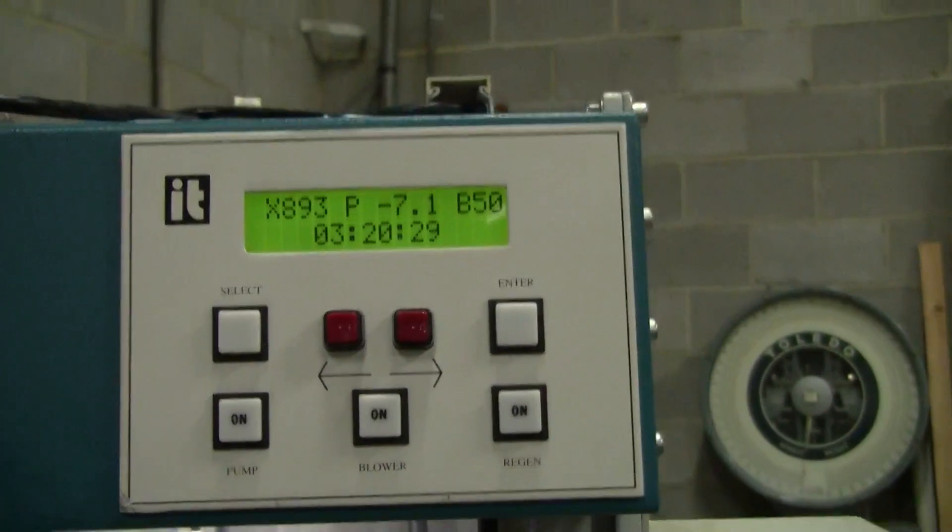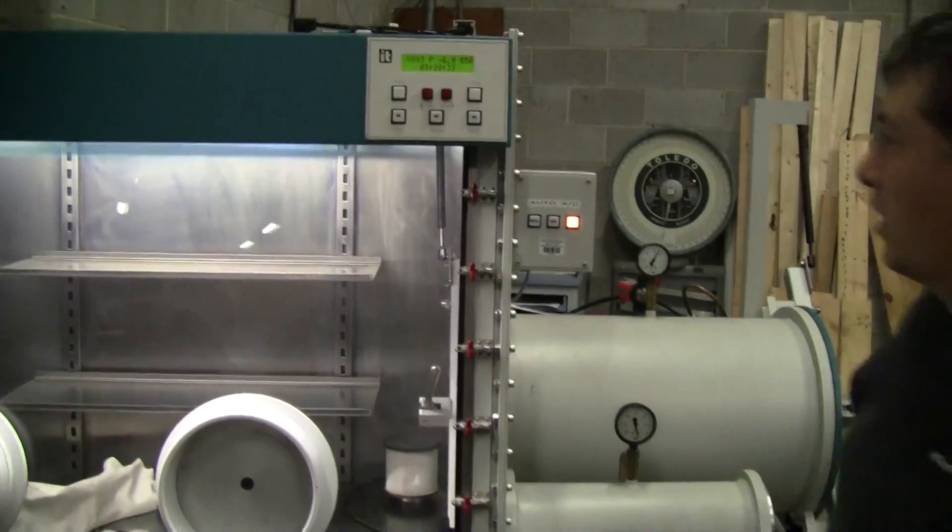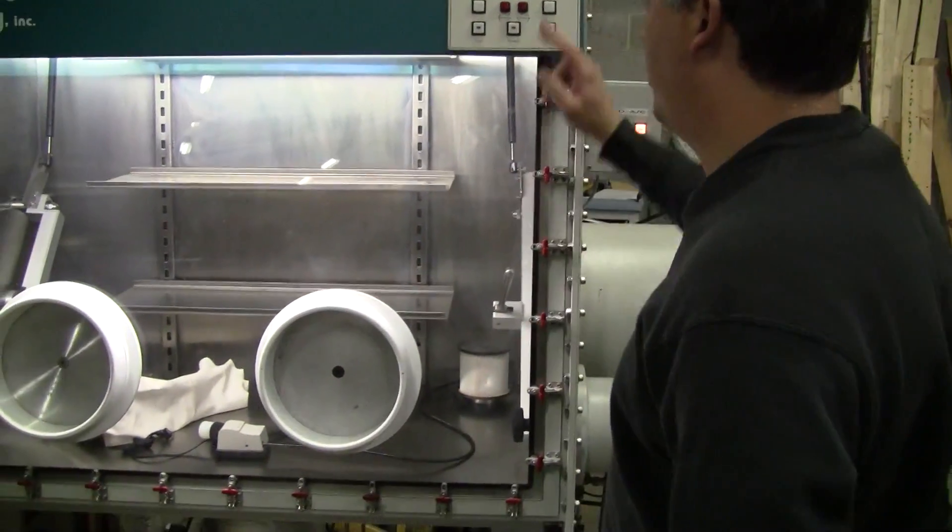Once the air line is plumbed in and hooked up, that'll connect into a solenoid, providing enough back pressure to hold the system completely.